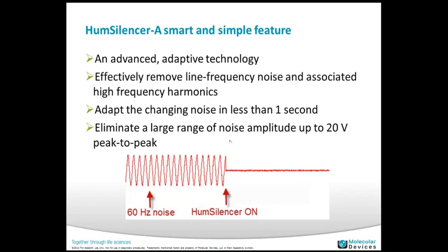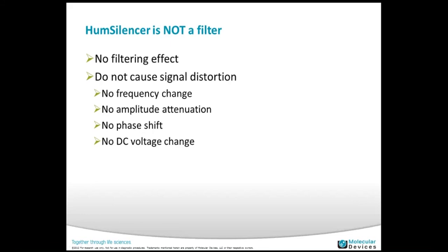Here you can see a beautiful 60 Hz noise signal. Once I turn on the Hum Silencer, the noise is gone — by just a single click, very easy and fast. Hum Silencer is not a filter. I know researchers worry that it might have a filtering effect on the acquired signal, but I'm going to demonstrate that it has no filtering effect and does not cause signal distortion — no frequency changes, no amplitude attenuation, no phase shift, and no DC voltage changes.